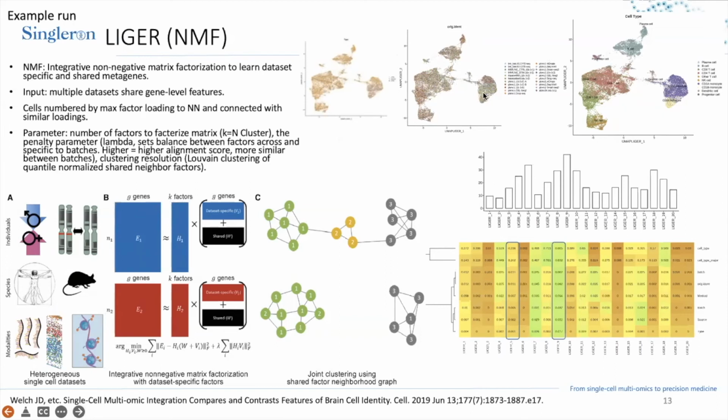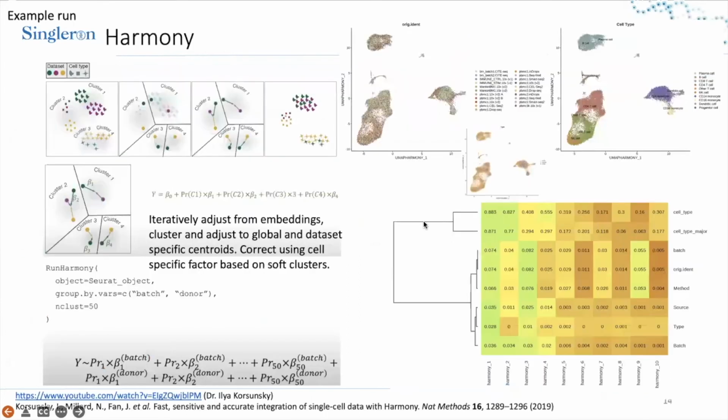So the disease samples are hidden from the normal samples to some extent. Yeah, but again, the embedding calculations show that the correction works by having a higher cell type driven variance compared to the lower batch driven variance. Okay, the next part is Harmony.